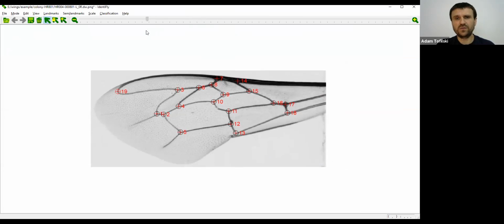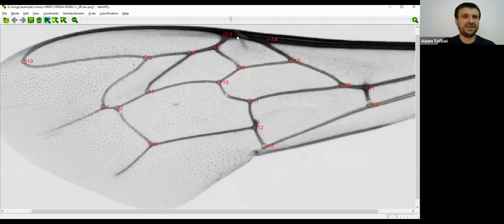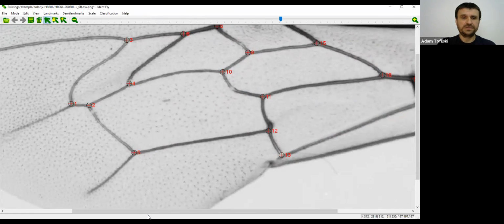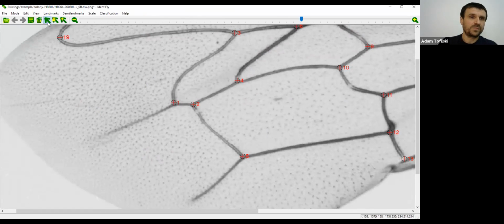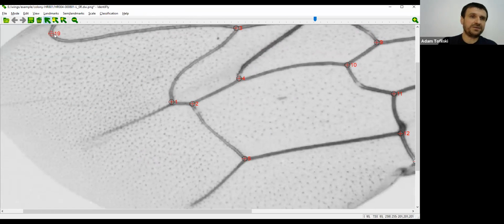So I suggest to make the circle smaller, and then it should touch. But in this case, you should make it larger, and the circle again even larger. So the circle touches the edges of venation in the most distant point of this marginal cell.